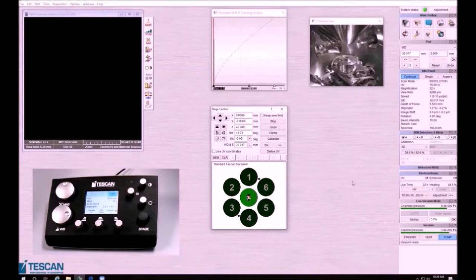A few things to acknowledge before we begin: you'll want to be sure that your vacuum is completely ready, as you will not be able to image your sample if it is not. If you do want to go into low vacuum, you should come down to full pressure first before going into low vacuum — but that is a tutorial for more personalized imaging needs.